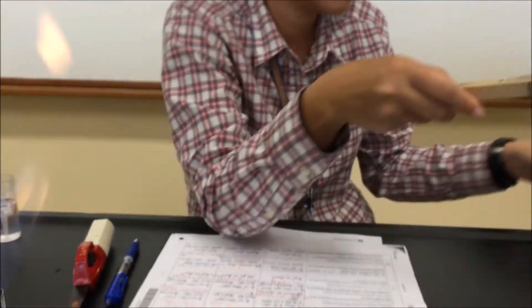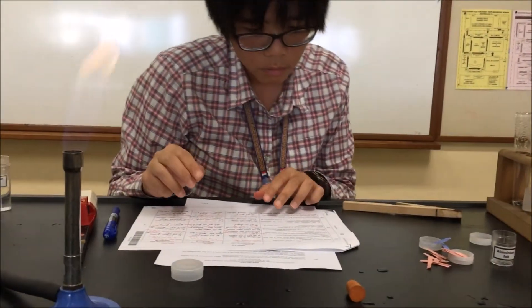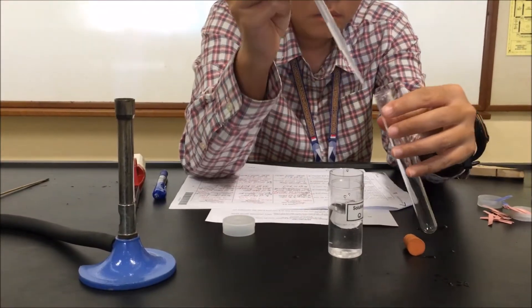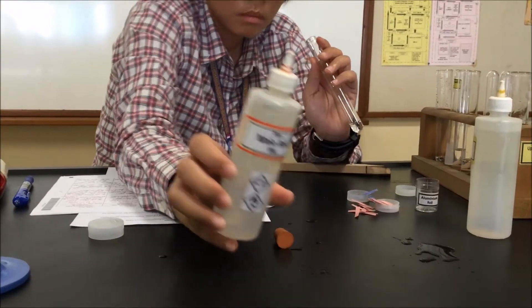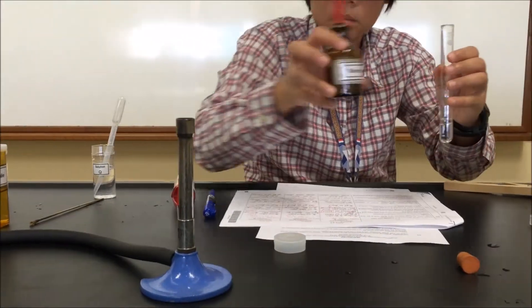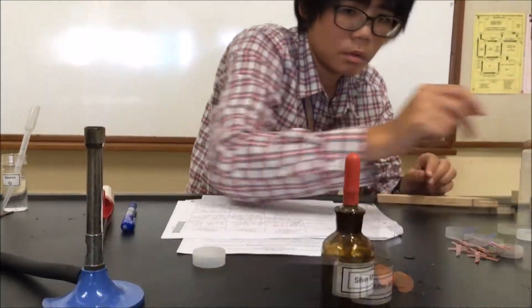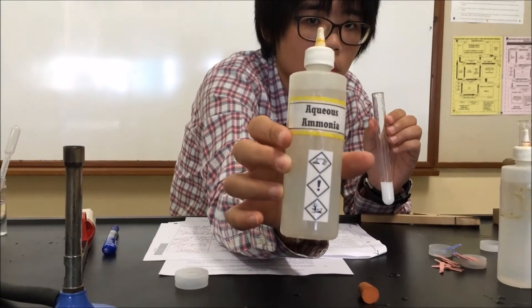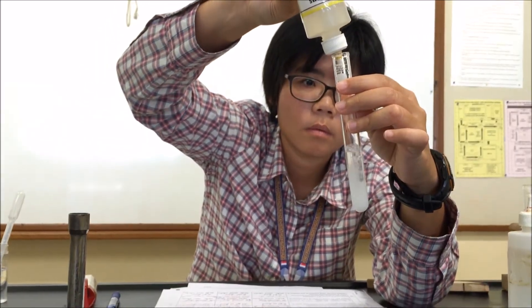Moving on to Part C: one cubic centimeter of Q in a test tube, followed by one cubic centimeter of nitric acid, then silver nitrate — we are again testing for the chloride ion. We are on the lookout for a white precipitate, which we do get — a positive test. For the excess ammonia step, the white precipitate is soluble in excess ammonia, confirming the result.